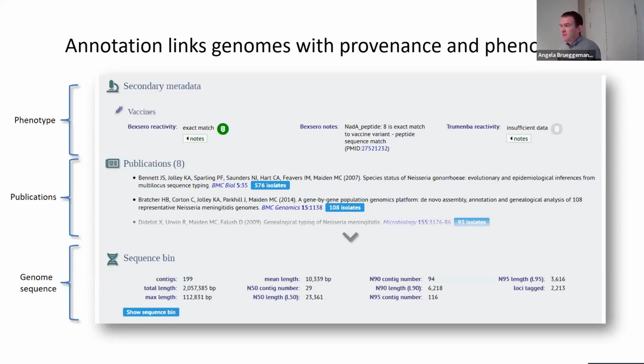And so we store these in a different way, in a sparse table. This is an implementation detail that you don't really need to care about, but within the database, it's basically a 3-column table. We have the isolate ID, the field name, and the value. That allows us to store any number of arbitrary extra values, only using space for data that you've got and not reserving space for all the records that don't have that information.